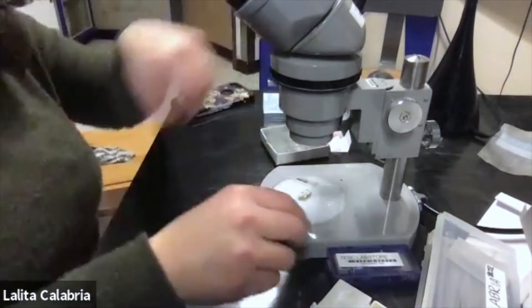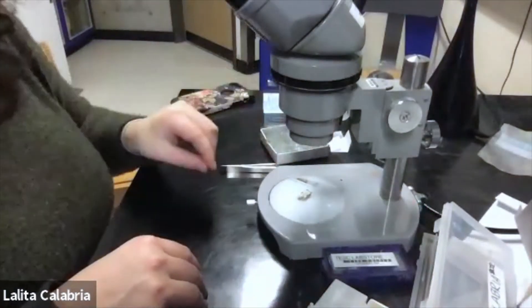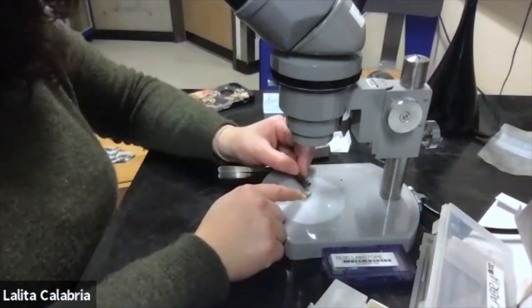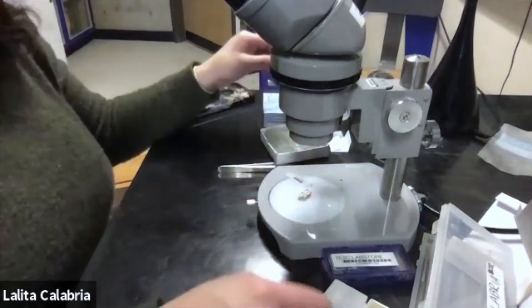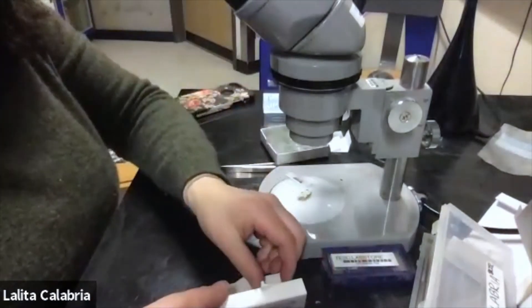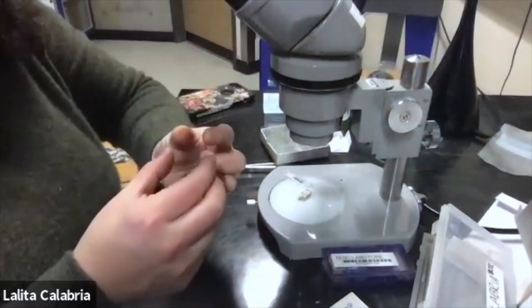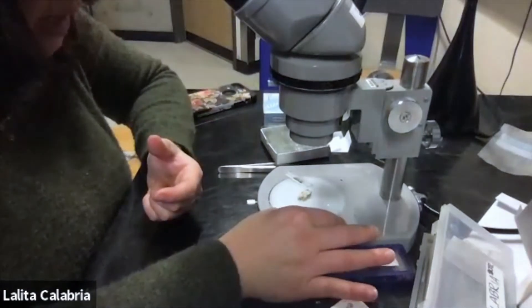From your dissecting kit you might choose to use forceps to transfer the sections, or you might just use the tip of the razor blade. The capillary action will suck the little section of the apothecia directly into the water. You'll also want to have your cover slips handy — grab one by the sides and avoid putting your fingers on it to prevent fingerprints. Set it somewhere nearby, next to your sample.